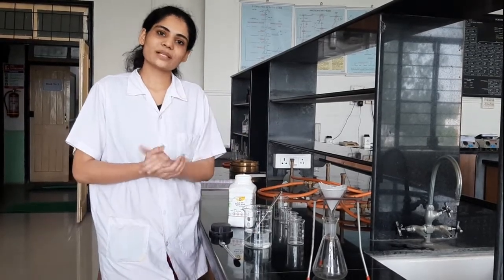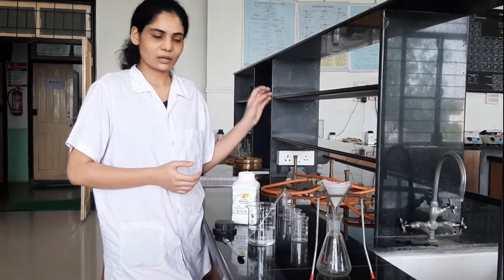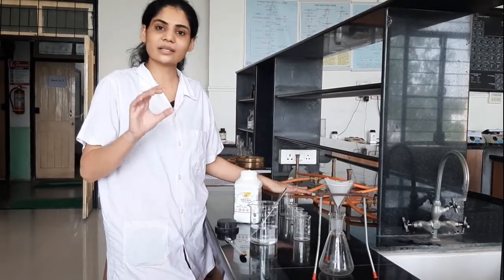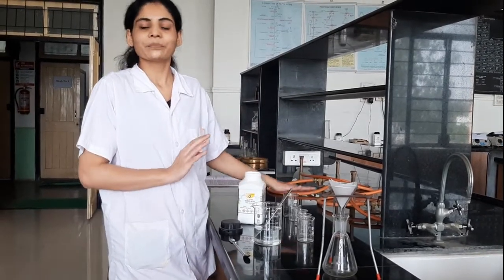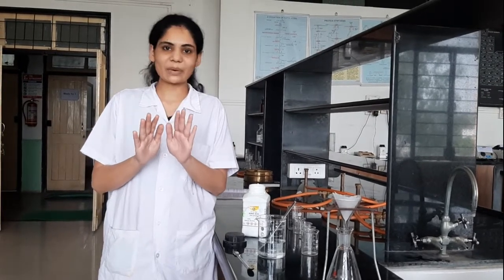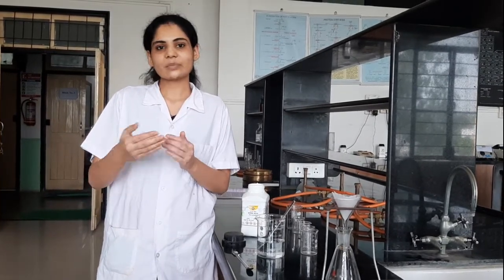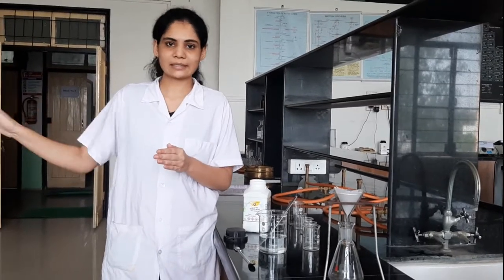That supersaturated solution, we will divide into 6 parts of 30 ml each. Those 6 parts we will keep for different times: one part for 10 minutes, the next for 20, then 30, 40, 50, and 60 minutes. So for 1 hour we are going to do this practical.